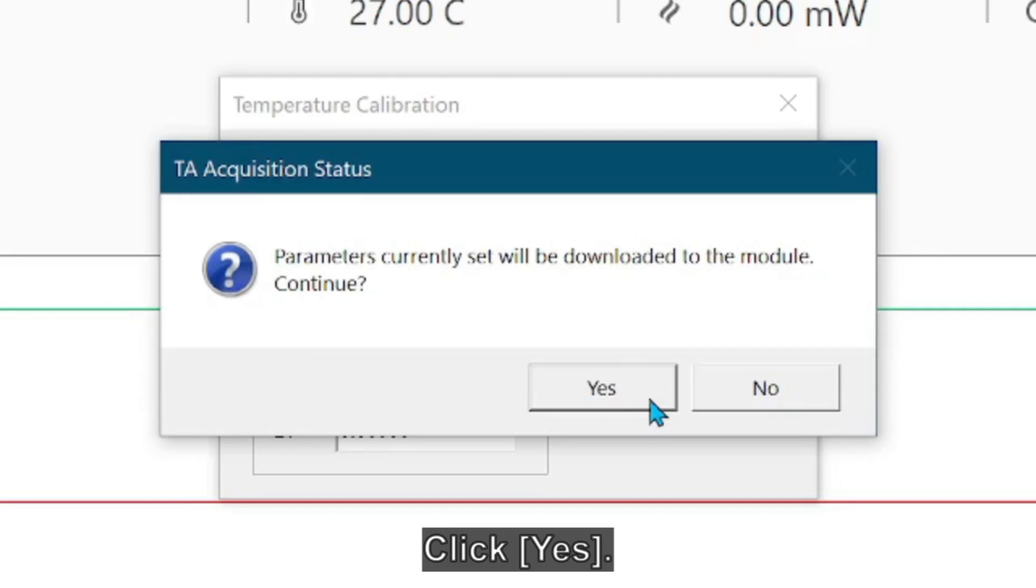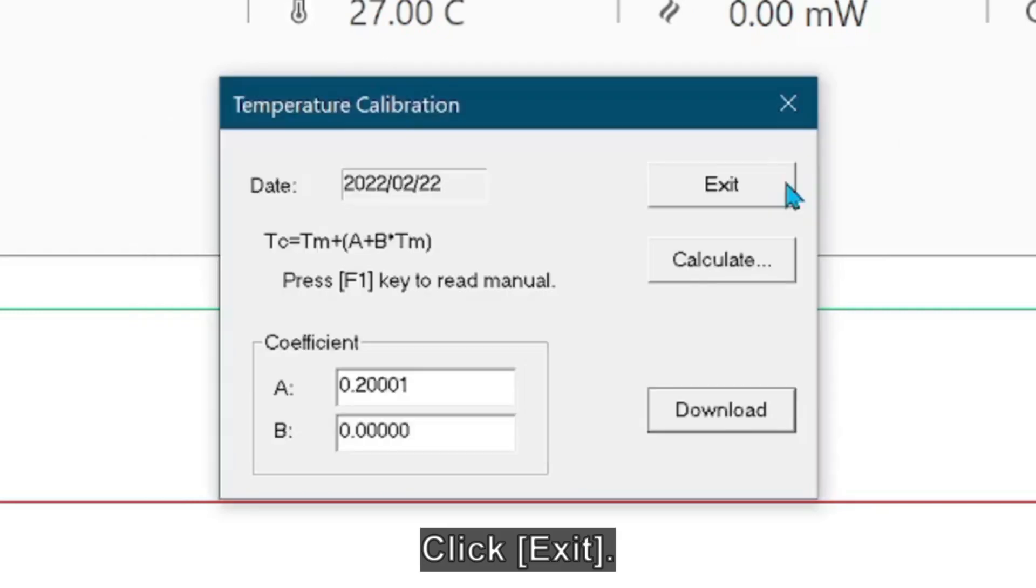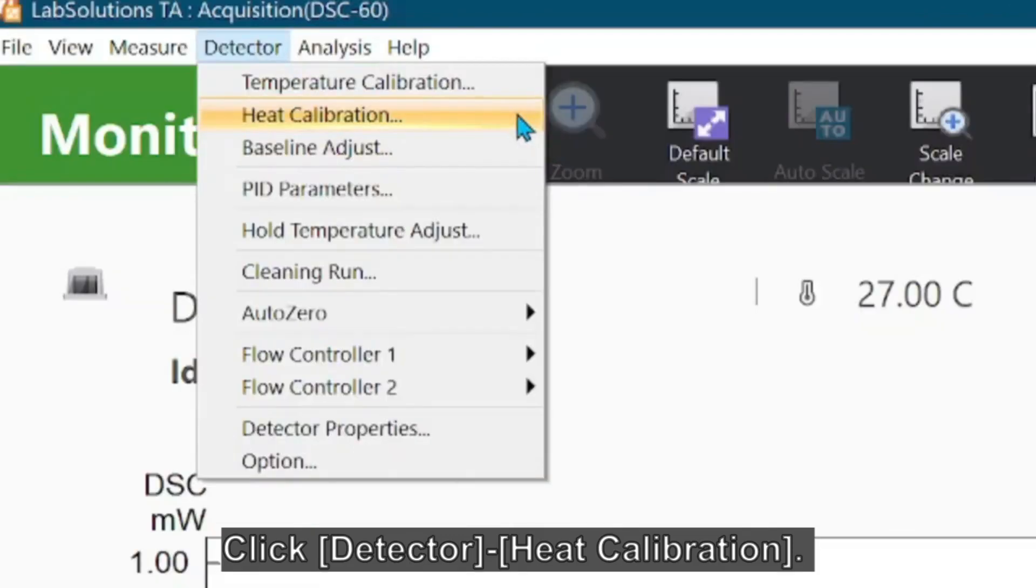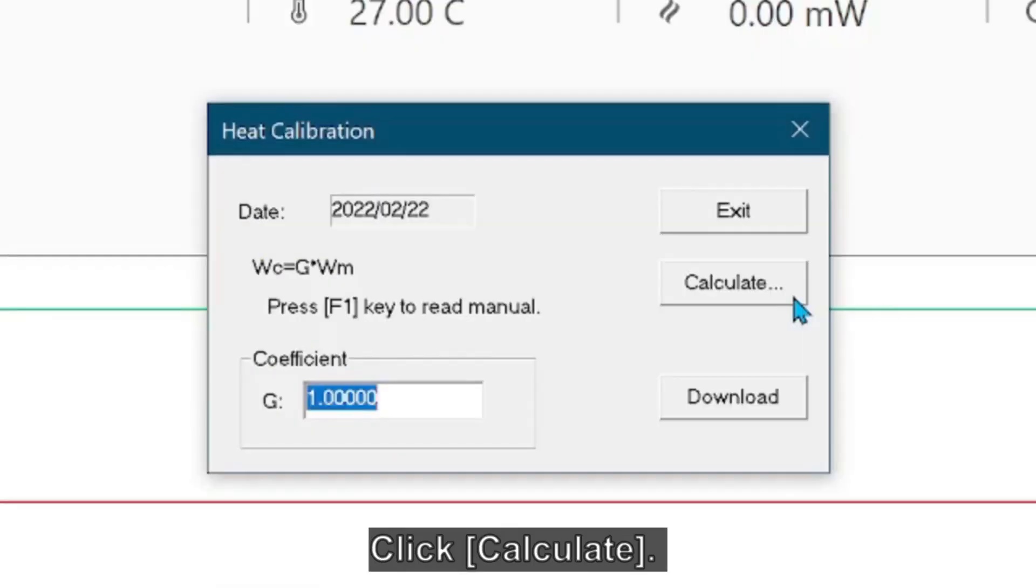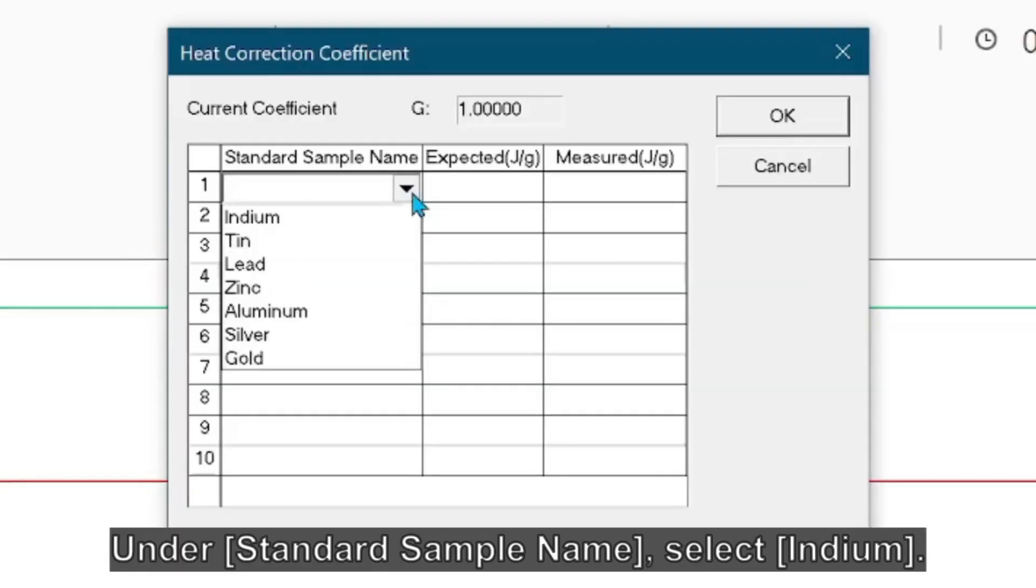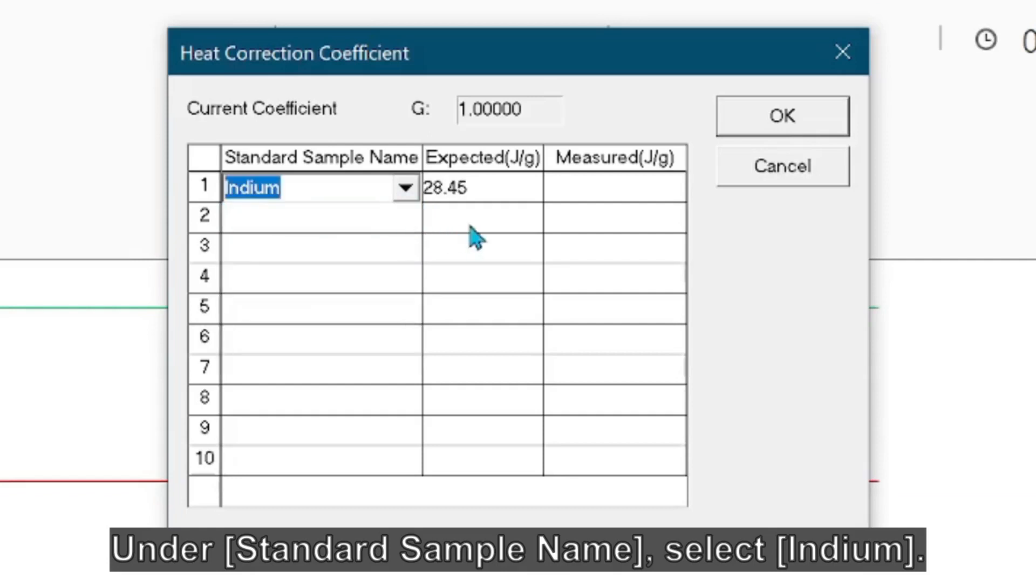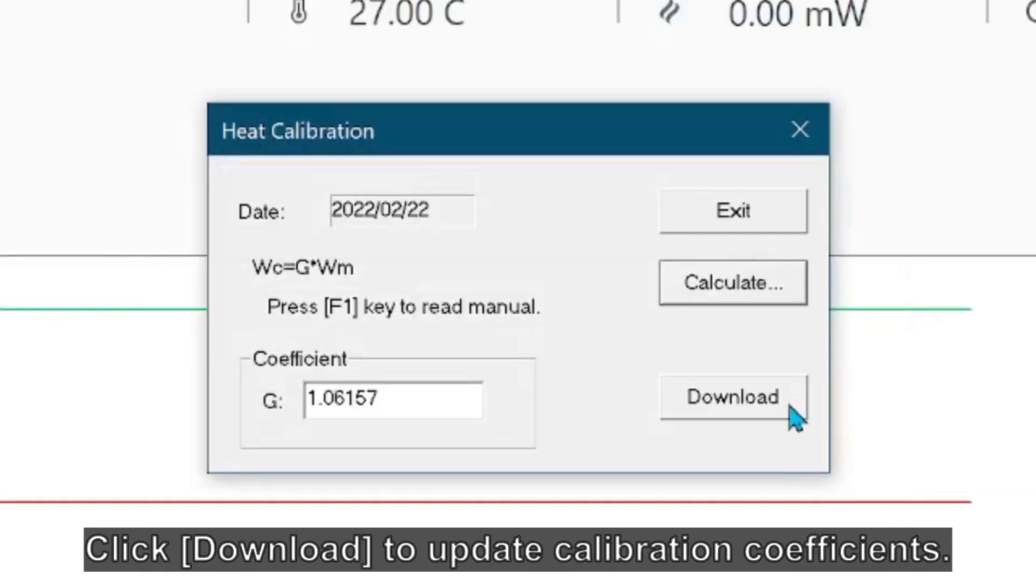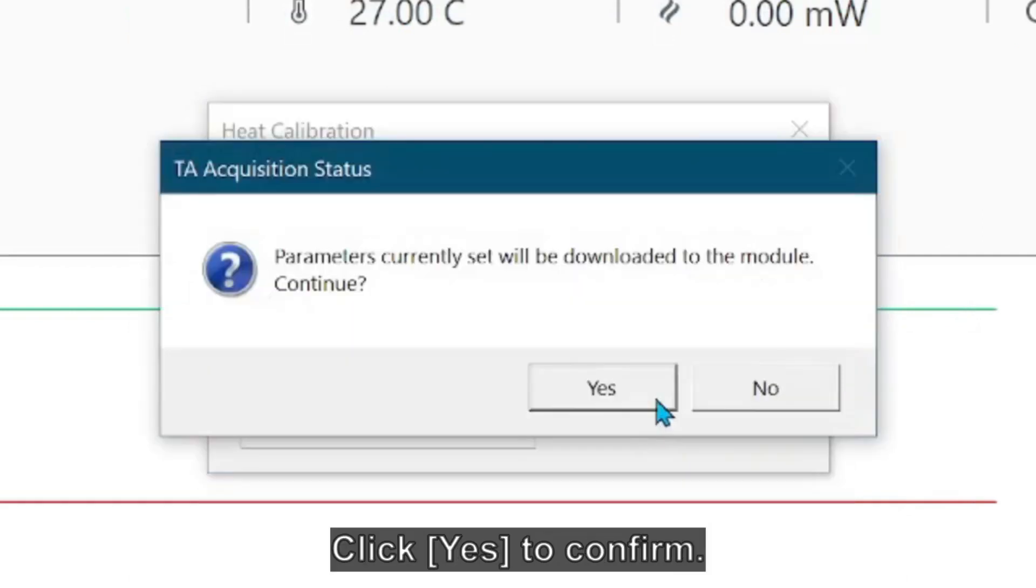Click Yes to confirm. Click Exit to quit. Next, click Detector and select Heat Calibration, then click Calculate. Under Standard Sample Name, select indium. Enter measured enthalpy from indium, then click OK. Click Download to update calibration coefficients. Click Yes to confirm.